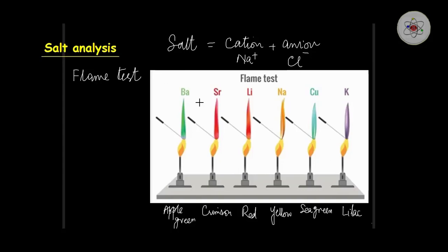If these ions are present in the salt, they can straight away be found out by doing a flame test on solid salt. Right.